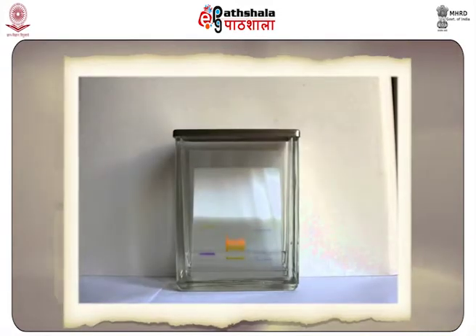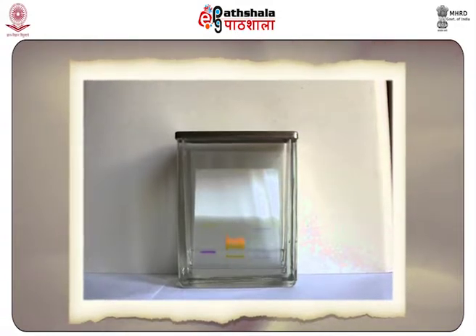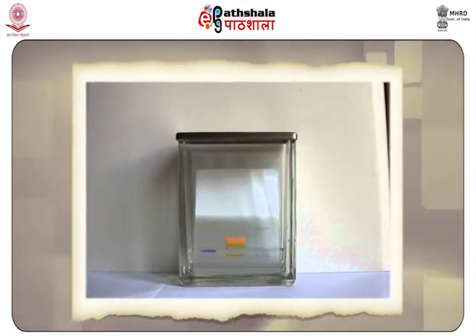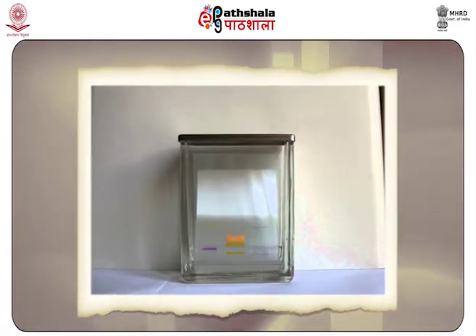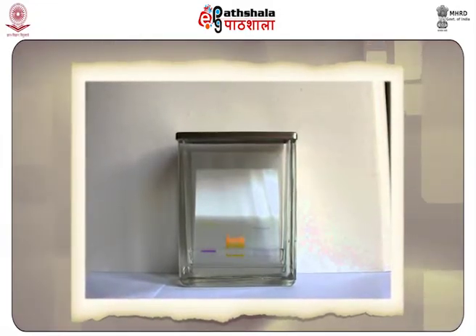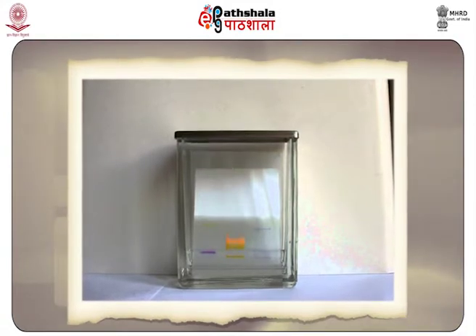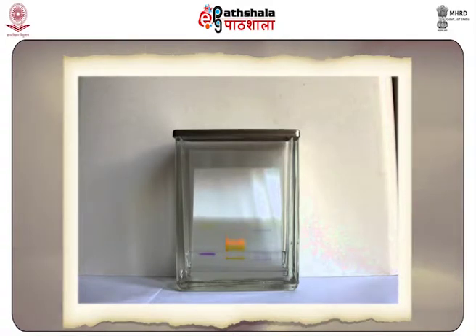Chromatography relies on the basic concept of differential solubilities and affinities of the different components of the mixture. The mixture that is to be separated out is dissolved in a suitable solvent called the mobile phase, which carries it through the second component called the stationary phase. Thus, choice of phases is purely dependent on the nature of the sample to be analyzed.